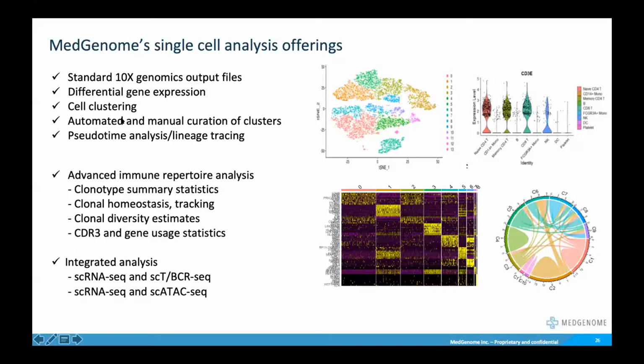and looking at the clusters of cells resulting from the selection of the most informative features from your single cell multi-dimensional gene expression data, and being able to annotate the cells that have been identified in these different clusters using a machine learning based automation, or using manual curation to identify these clusters based on known gene expression markers.